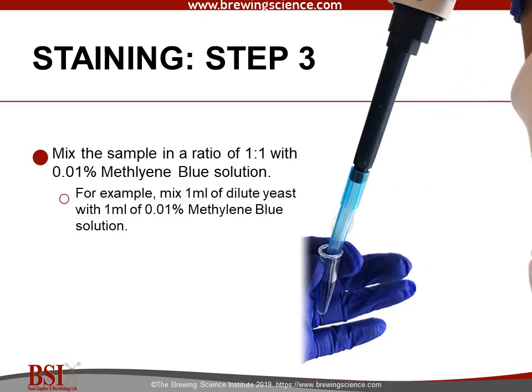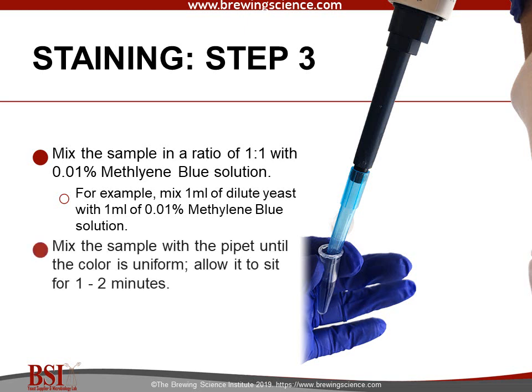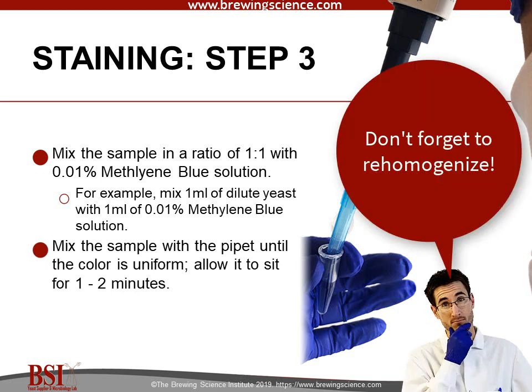Mix the sample in a ratio of 1:1 with 0.01% methylene blue solution. Mix the sample until the color is uniform. Allow it to sit for 1 to 2 minutes. After 1 to 2 minutes, be sure to re-homogenize the suspension before pulling a sample for count.